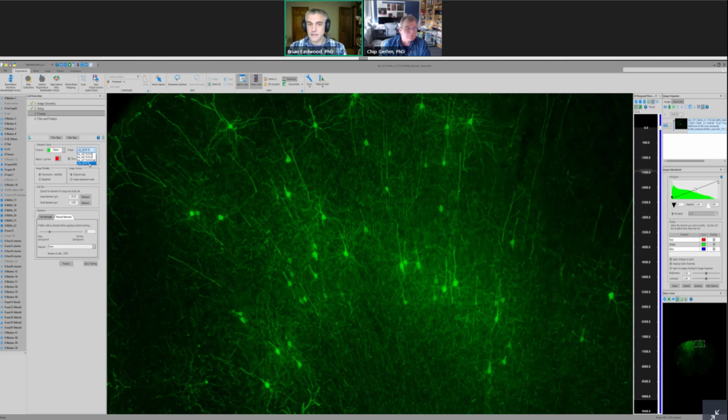We still use that scale space analysis. So we still have a range of sizes that we're looking at. We also still use that cell strength filter. Here we're using it as a pre-filter just to filter out some stuff, as we mentioned, that stuff that's really close to the background, just kind of noise patterns in the background. We want to filter those out, but we set that threshold really low so that most stuff gets passed into our neural network. And our neural network is a much more sophisticated model of cell appearance. So it has millions of parameters instead of just a couple of parameters.